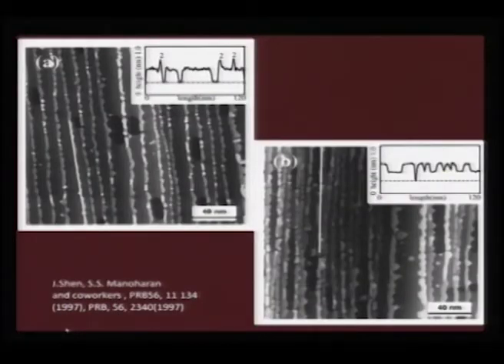And what can I do with this? From the cartoon that we saw in the earlier slide, we can use the same information and then try to calibrate how the iron is growing on this copper 111 surface. As you see here, this is iron on copper grown using a thermal deposition, and when you put some iron atoms, there is a step decoration that is happening. Only at the edge of this terraces iron atoms are going and sitting.